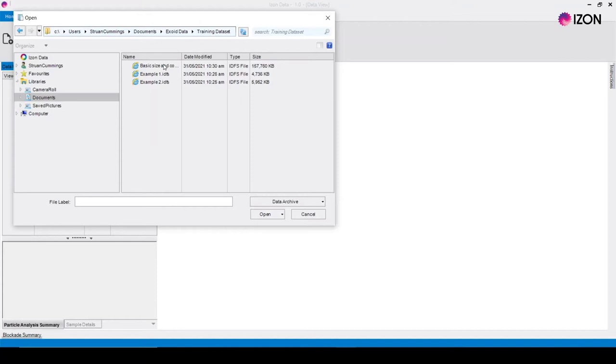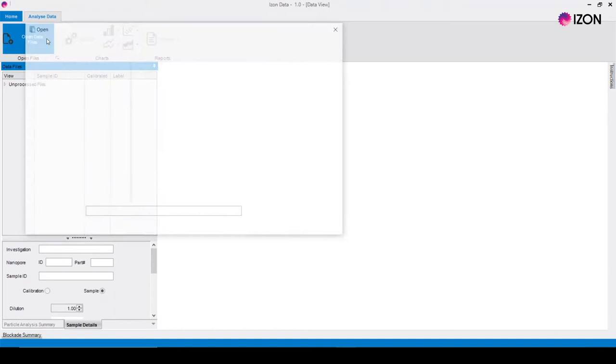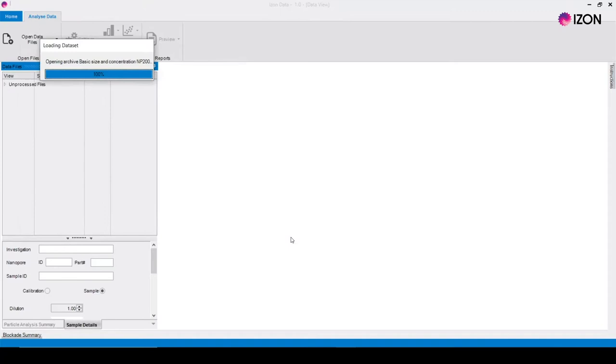Select all of the files you would like to open for processing and click open or click on the drop down arrow and select open all. You can hold control to select individual files or shift to select a range of files.